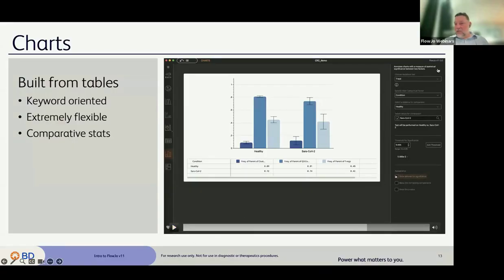The next step is she's going over here. Again, whoever made this movie for us is changing the context so that now we're doing a statistical test. And the choice is a t-test here. We're looking across that main category condition between the healthy specimens and the COVID positive patients.